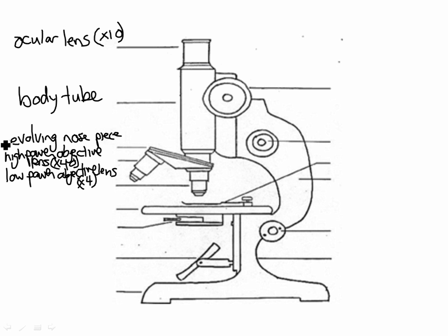This next one down here is called the stage. Is it called the stage? The stage, and that is where our specimens go. We put them on slides, and that slide goes on the stage and gets secured by the clips, and they're called the stage clips. I'll go to the other side and get those now. The stage clips keep the slide from moving around.